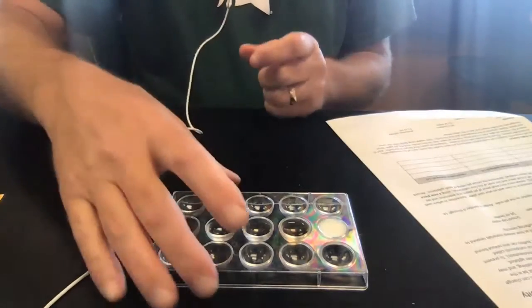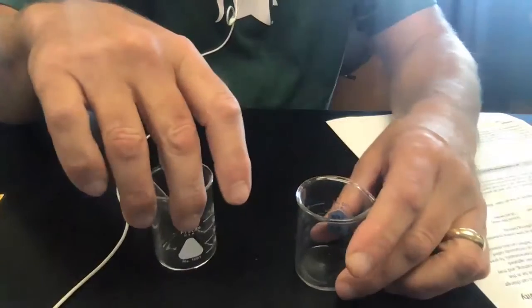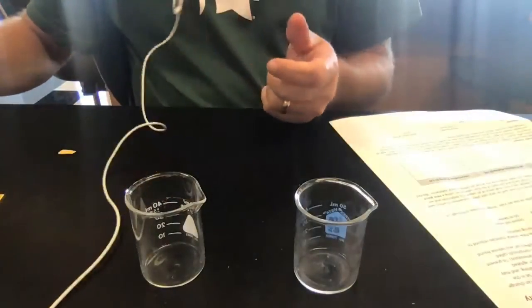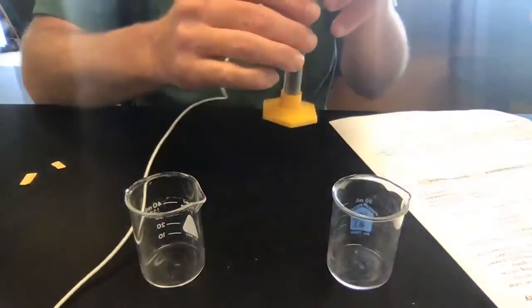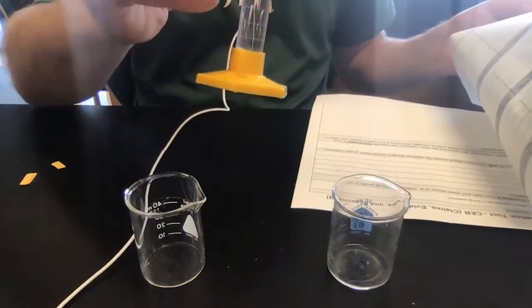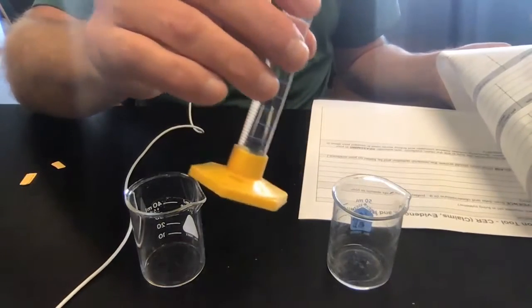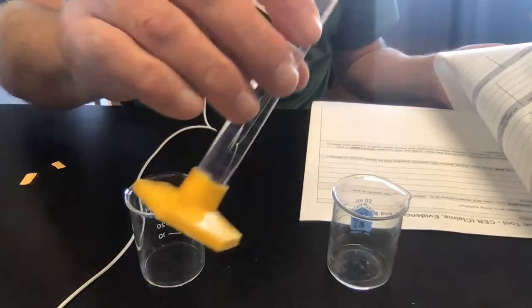So now we're going into the experimental part of this. So I don't need the well plate anymore. What we did, we're in teams of 4. So 2 people took on the acid test, 2 people took on the base test. It's really the same test. It's just you're adding a different solution. So in each case, we started with water. So if you're looking at page 2, there's data tables, and water is the first one listed. The first data table deals with adding the HCl, which is the acid, the hydrochloric acid. And the second table deals with adding the base, the NaOH or sodium hydroxide.